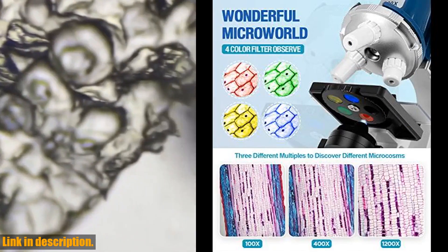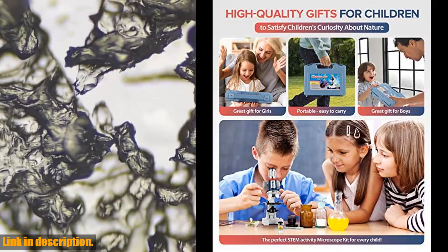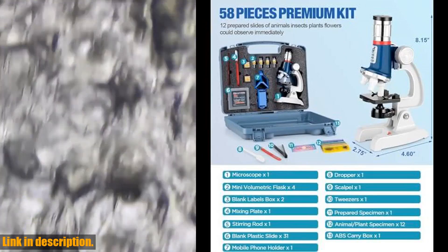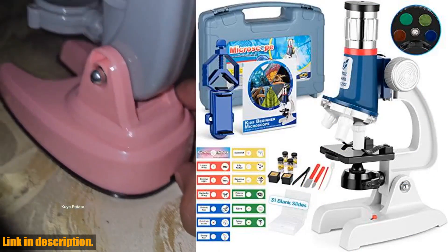It's the perfect engaging activity for the whole family, offering a fun and educational experience for all ages. With 100x, 400x, and 1200x magnifications, this microscope kit offers a view of the microbial world that will captivate kids and adults alike.